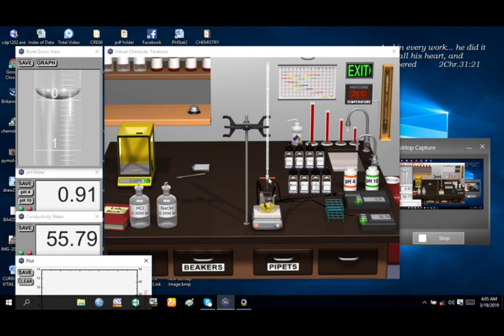All you need to do in this lab is just clicking and clicking and clicking. Now you're already familiar with all these various equipments. These are various indicators. The one that is being used here is highlighted, and you see the color here.